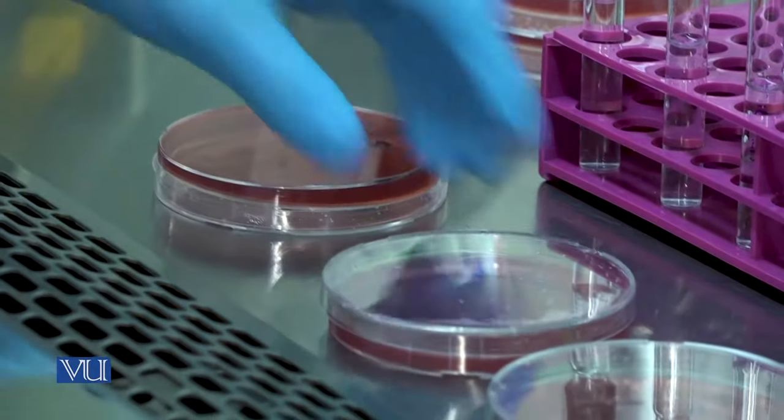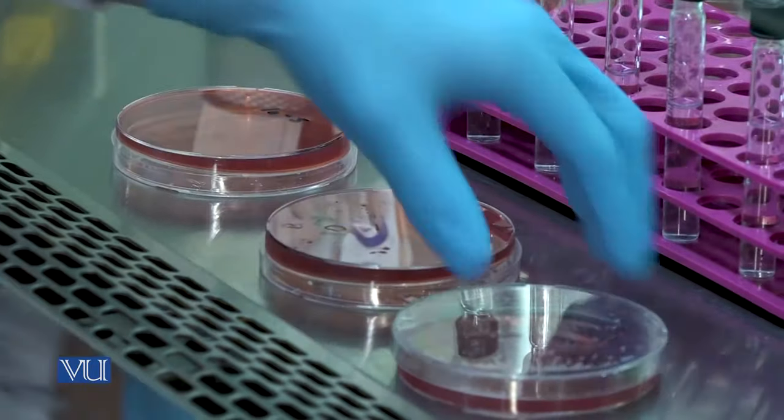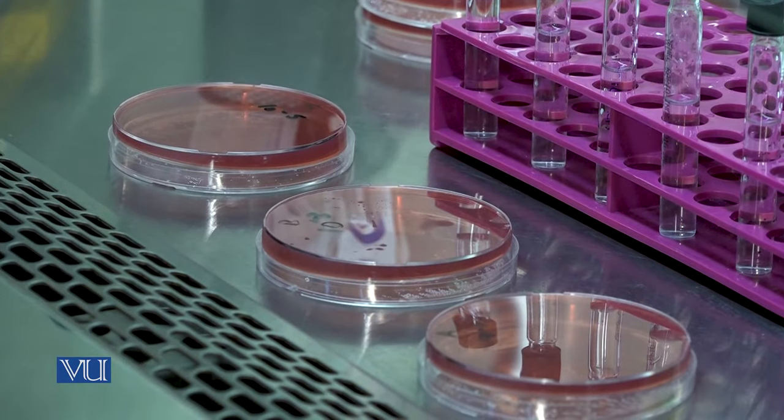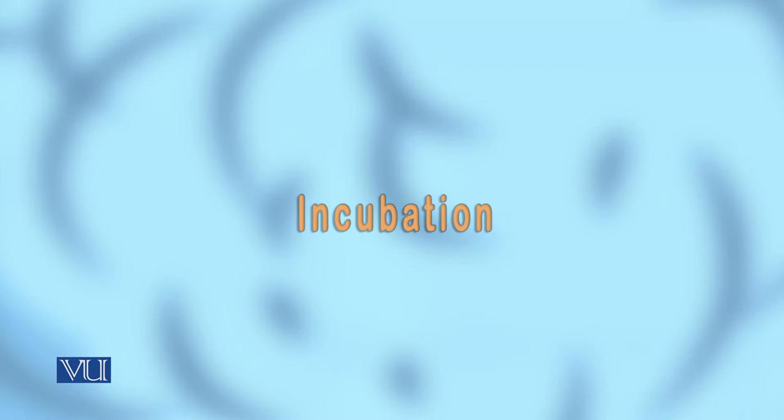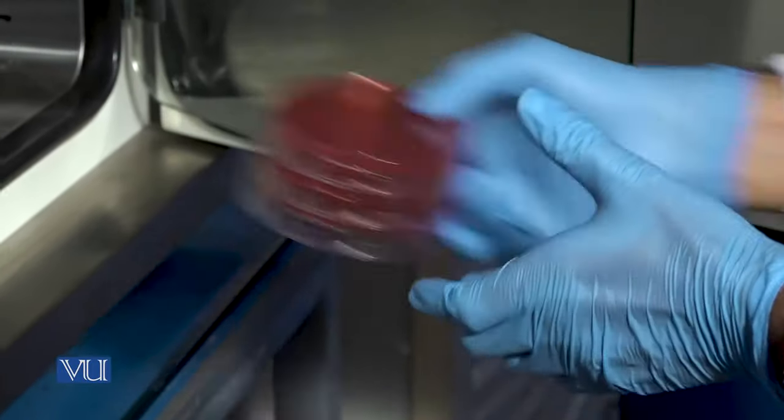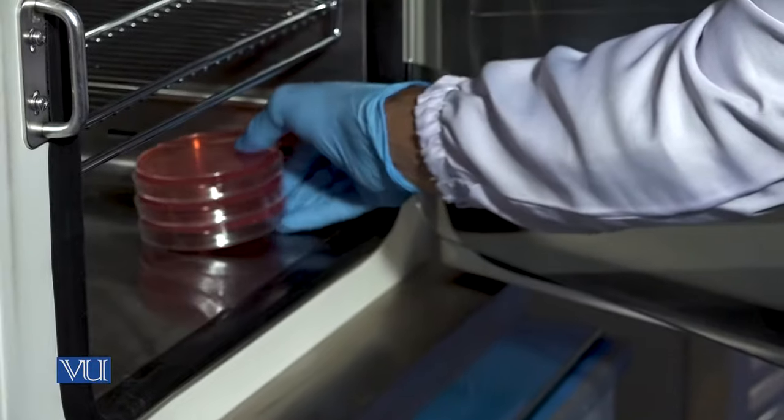Now, invert all the culture media petri plates for incubation. Next, place the culture media petri plates into the incubator at 37 degrees Celsius.